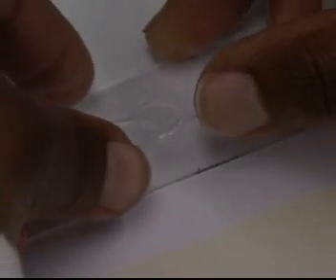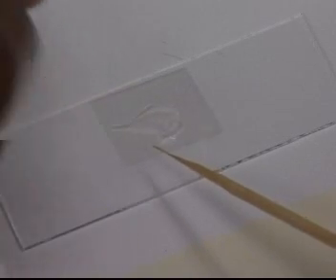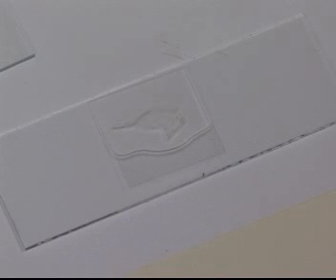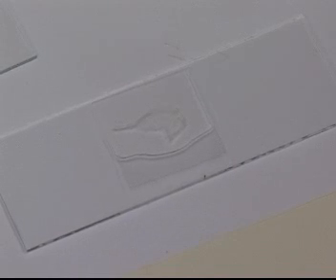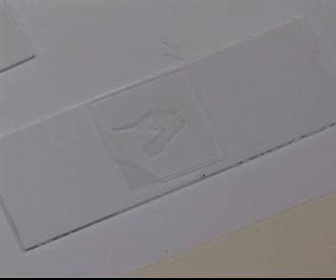Keep the cover slip at an angle and place one edge onto the side of the water droplet on the slide. The water will spread along the edge of the slide. Now, using a dissecting needle, the cover slip is gently lowered onto the specimen, making sure no air bubbles are trapped between the cover slip and the slide.